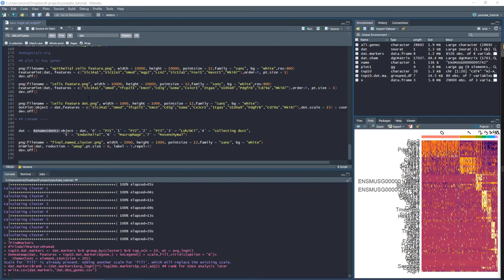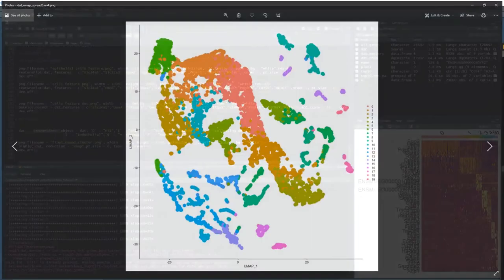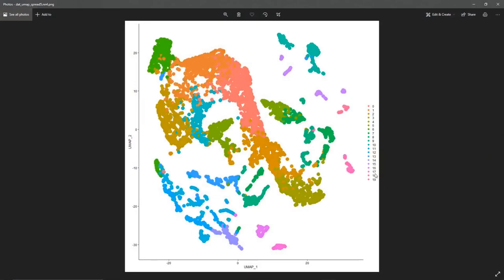And there's definitely a degree of artistry, I suppose, when you're trying to decide how many clusters there should be, because you want to be exploring, perhaps looking for novel cell types, but equally you need to be confident that you're finding all the cell types that should be there. And if you push your resolution too high, you can generate, as you saw here, 20 cell types. But I'm almost certain that there's not 20 discrete phenotypes of cells within this data set.